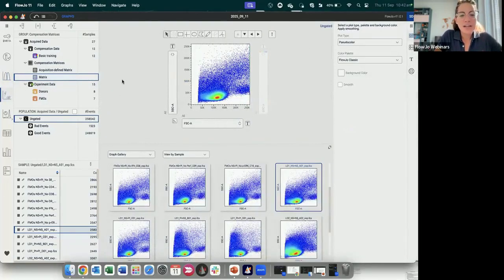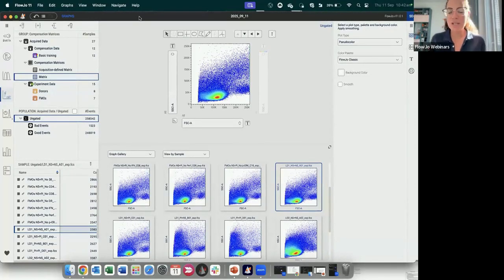And finally, we are at our gating strategy. So I don't want to spend too much time on the compensation. First, because there will be a webinar specific on that. And second, because we have a video on compensation on the FlowJo University. And third, because not everyone on this webinar is actually interested in doing the compensation. Most of the people do the compensation on the instrument, so they don't recalculate that in FlowJo. So I want to be happy to make everyone happy, actually, and go through a full workflow as much as I can.